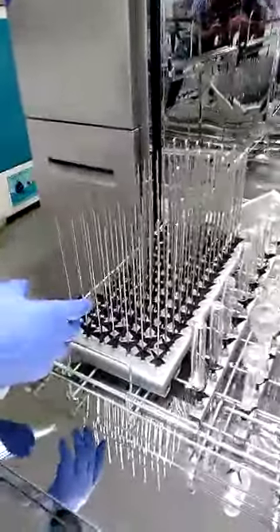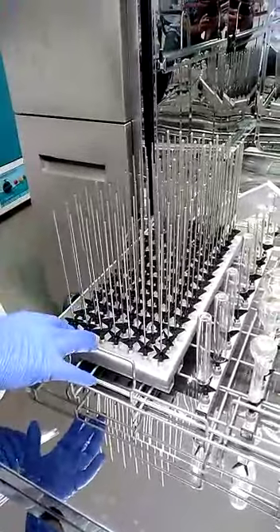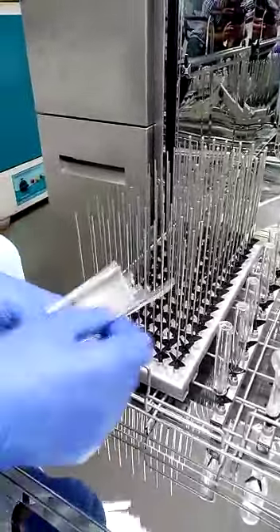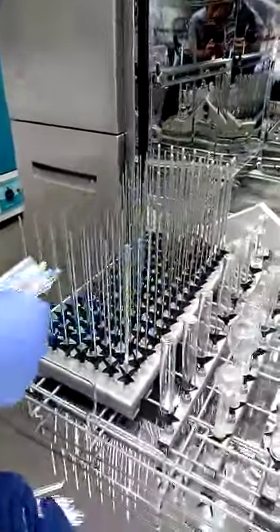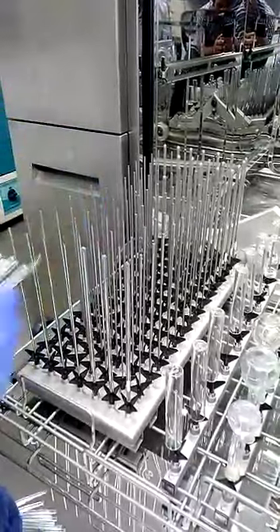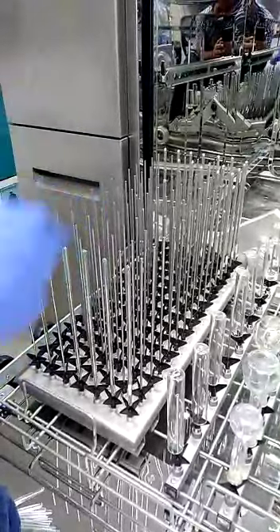This is our NMR tube tray, which is specialized for NMR tubes only. These are the NMR tubes which will be put on this nozzle. From this nozzle, the water will splash into the tube and it will get cleaned.